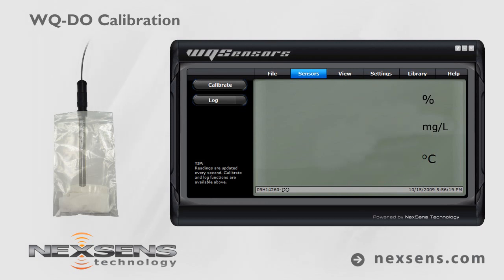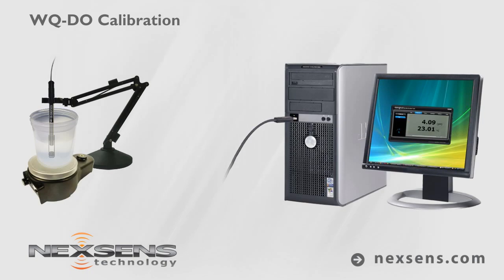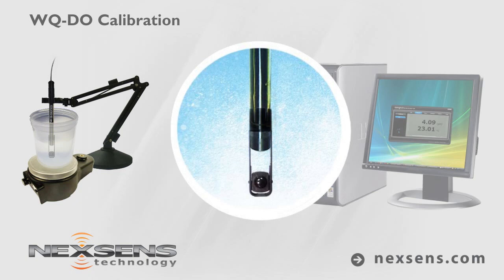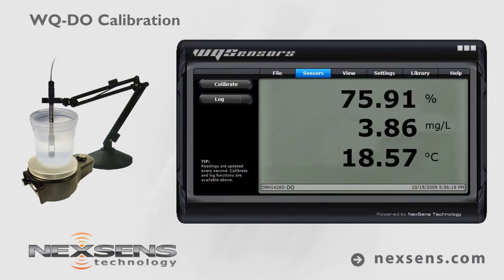Calibration is complete and the probe is ready. Make a measurement by immersing the probe in the sample. Gently stir the sample with the probe, or use the sensor tip stirring adapter with a laboratory stir plate. When the temperature and dissolved oxygen readings stabilize, the measurement is complete.